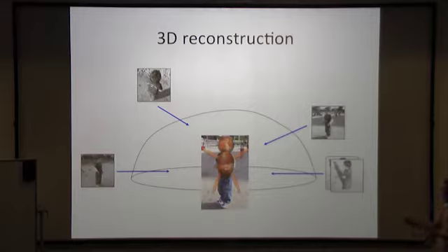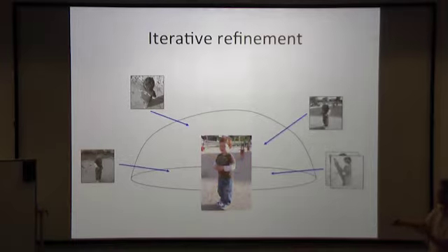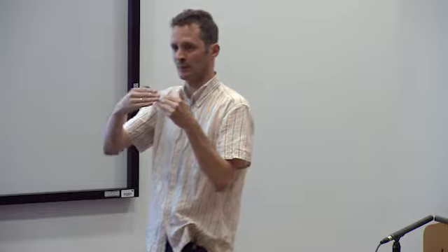And then we can repeat the process. So we can now again project this three-dimensional model that we have in all possible orientations, see which ones fit best, and hopefully now we will reduce the overall errors in the alignment, and we'll get a reconstruction where the influence of the orange puppet is reduced, and then hopefully we can do this until some kind of convergence point where we get a true 3D reconstruction of Jan. So this kind of iterative refinement process can serve to remove template bias.